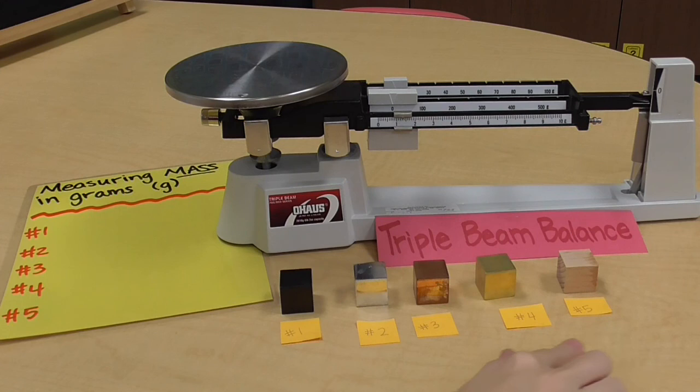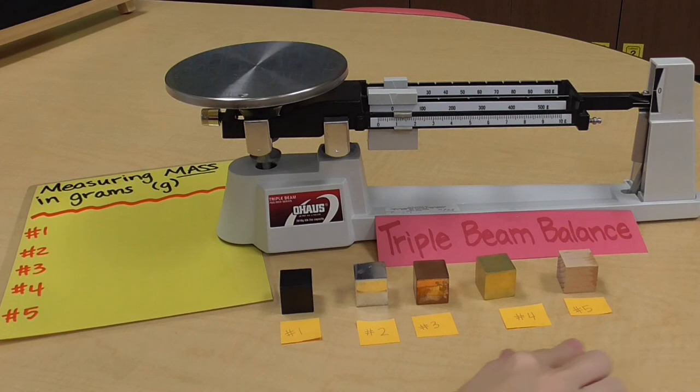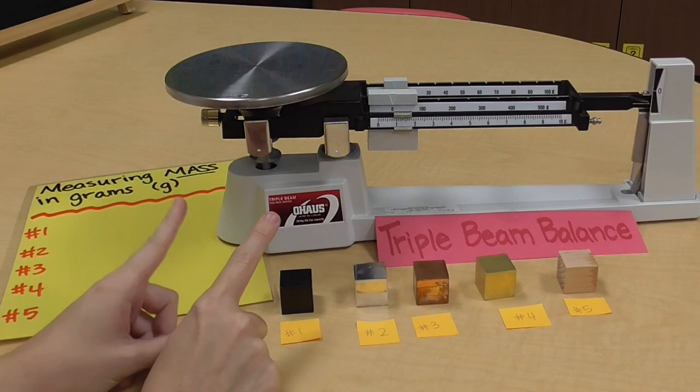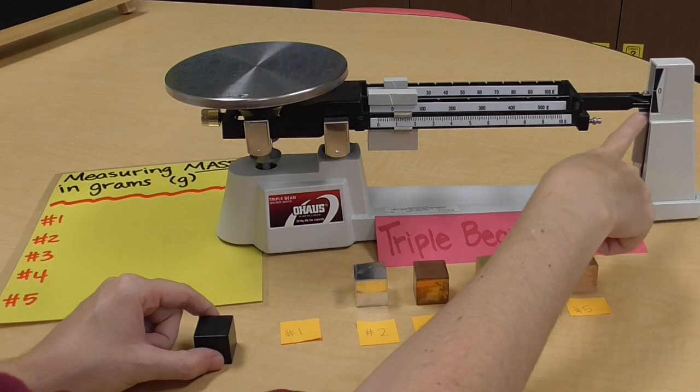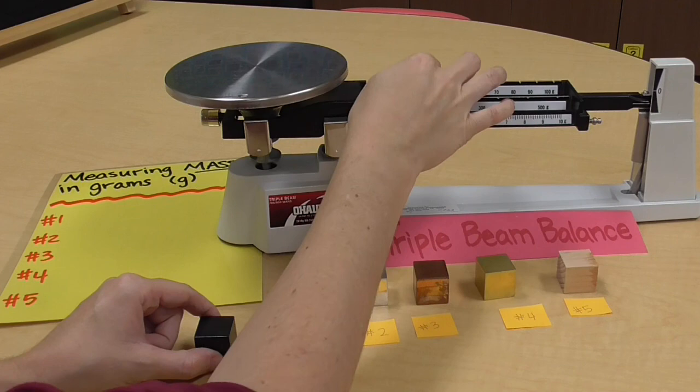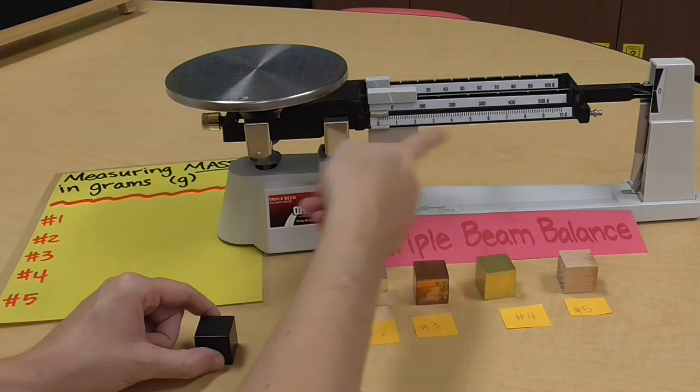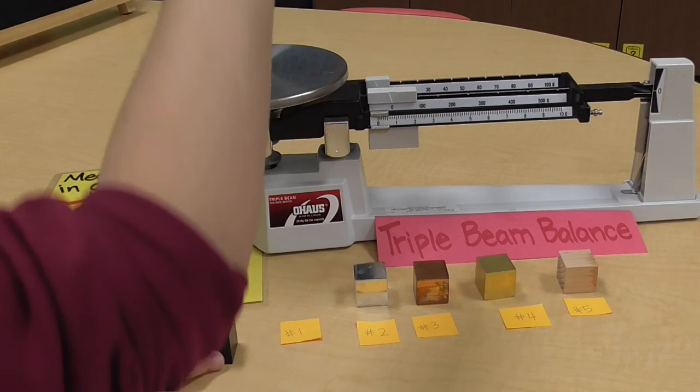So, here are our five mystery items that we don't know what they are, but we're going to measure their mass in grams using our triple beam balance. So, I'll start with number one. First, I need to make sure that my pointer is at the zero mark right here. As you can see, it's not because not everything is pushed over to the left, all the way at the zeros. So, I'm going to push everything all the way to the left so that my ones place is at the zero, my hundreds place in the middle is at the zero, and my tens place in the back is at the zero.